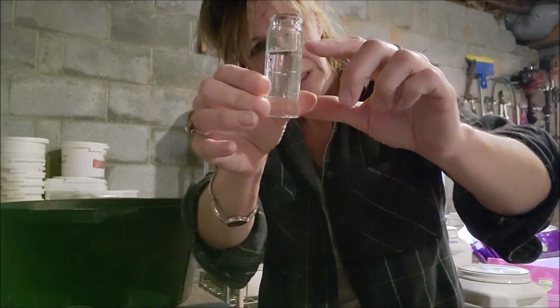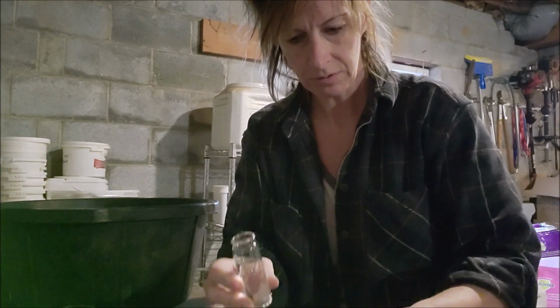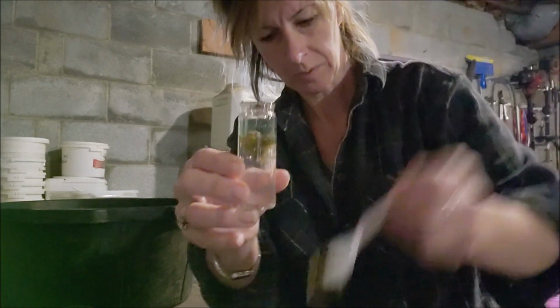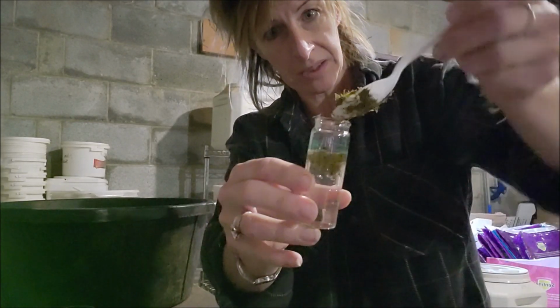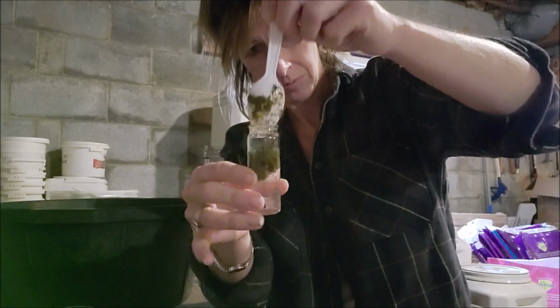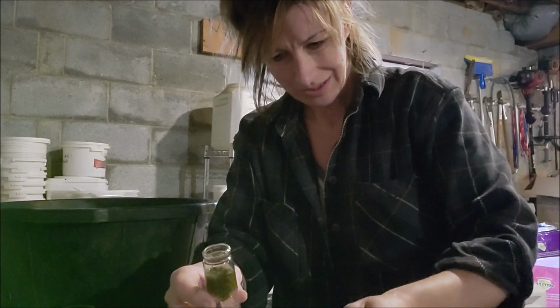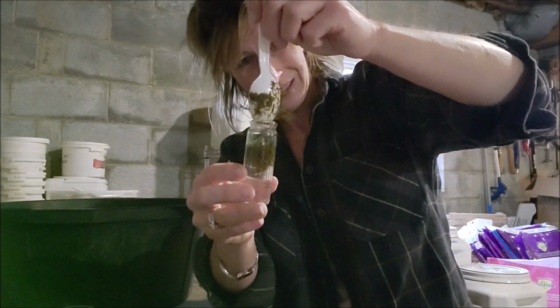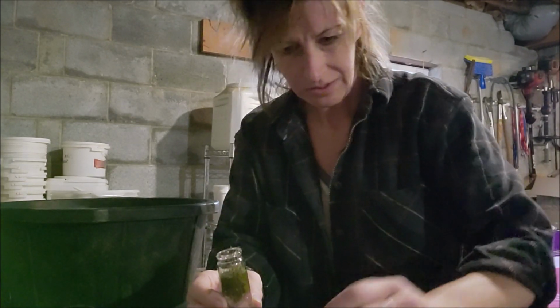And now we have to fill the rest of this up to here with our poop. So you grab it and you just drop it in. Like that, because you don't really need a lot, but you do need enough to mix it up. Come on now. There we go. Without going over. Now, the day that we did this class, we used these little tongue depressors, and that was much easier. Ooh, I don't want that one in there. That's going to be a lot of grass. Let's find another good piece.